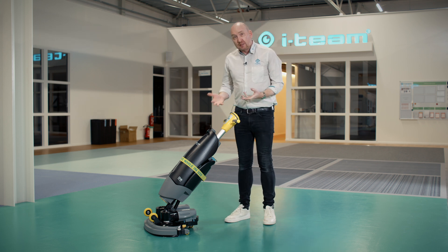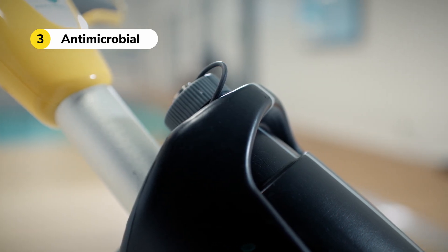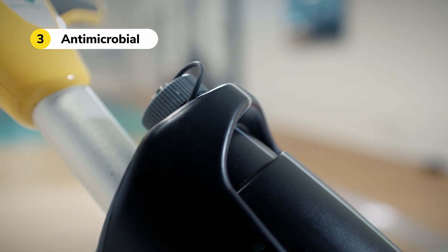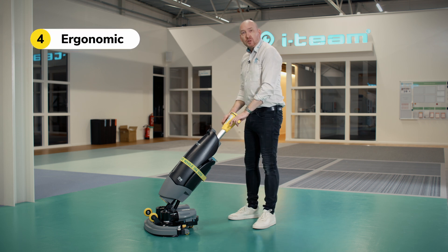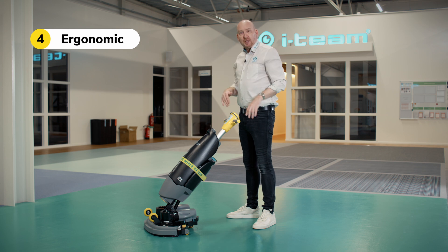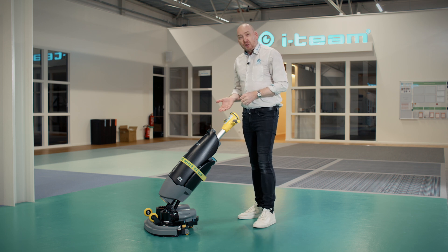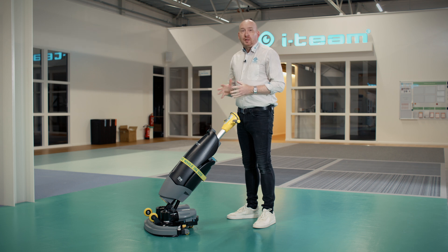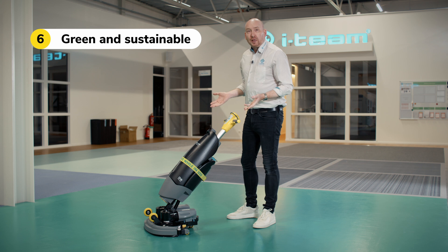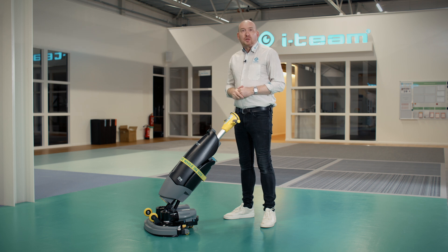Next, it's safe — we have antimicrobial tanks built into the plastic so it won't grow bacteria on the inside edges of the tank. Then it's better because it's ergonomic. You'll see that when working with the machine, you're standing up, facing forward, not down on your hands and knees doing manual cleaning. The machine can also be used both inside the clean room environment and outside, like on your sticky mats outside the clean room. Finally, the machine is green and sustainable, because we don't have to throw away microfibers or any other type of material between uses — we can reuse the parts on the machine.